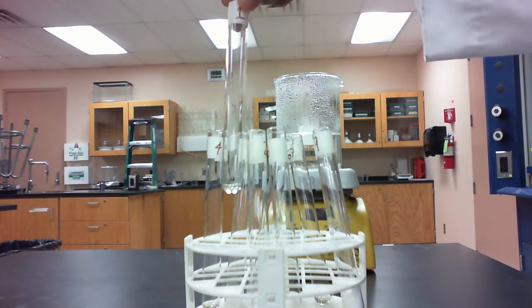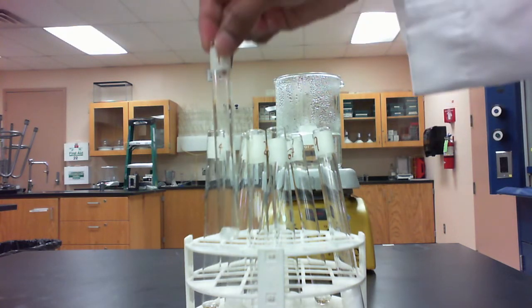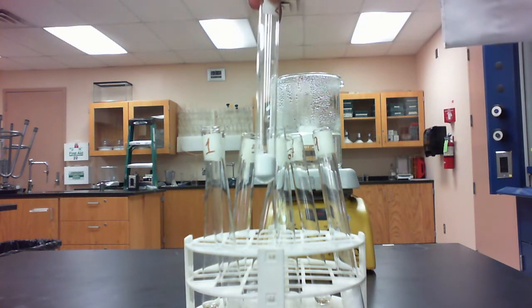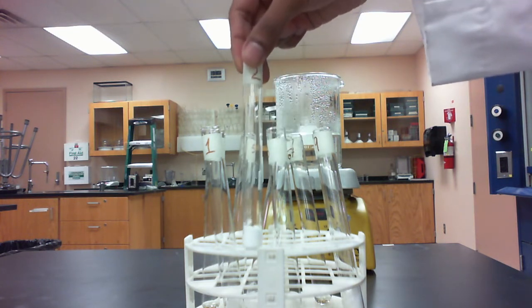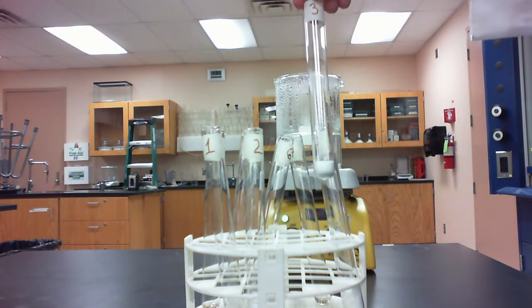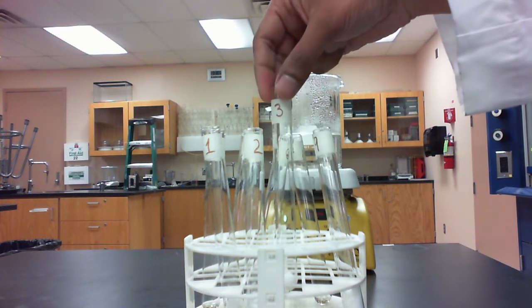Acetic acid is the common name for ethanoic acid, and you'll see it's a clear liquid. In test tube 2, I have approximately 1 gram of benzoic acid, and you'll see benzoic acid is a white crystalline solid. And then in test tube 3, I have approximately 1 gram of salicylic acid, which is also a white solid.